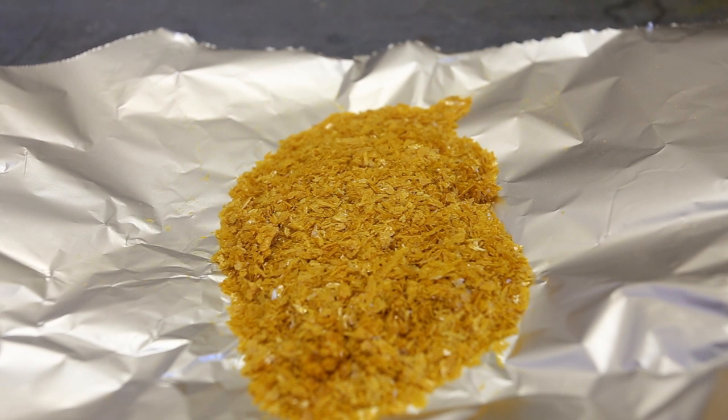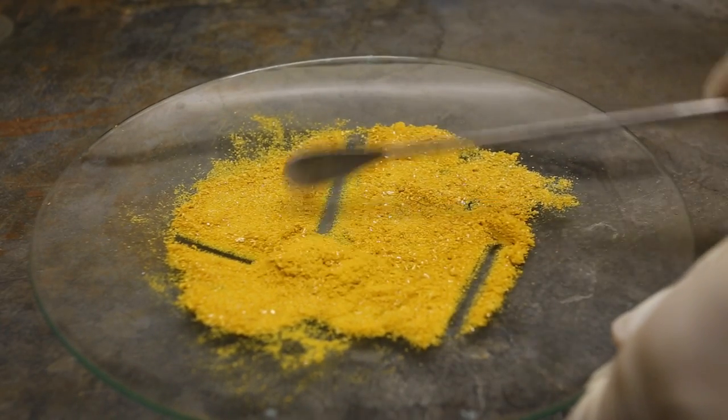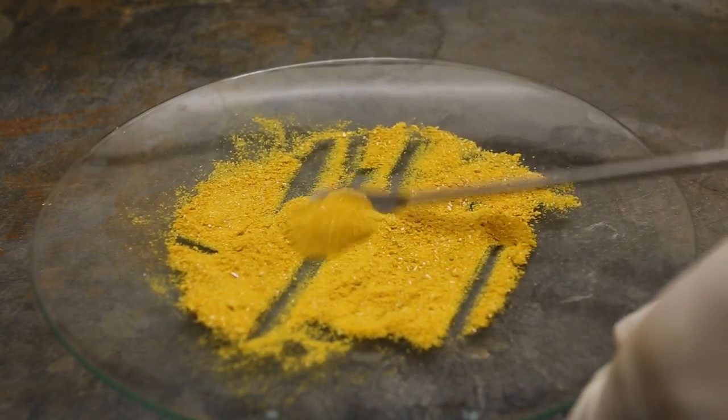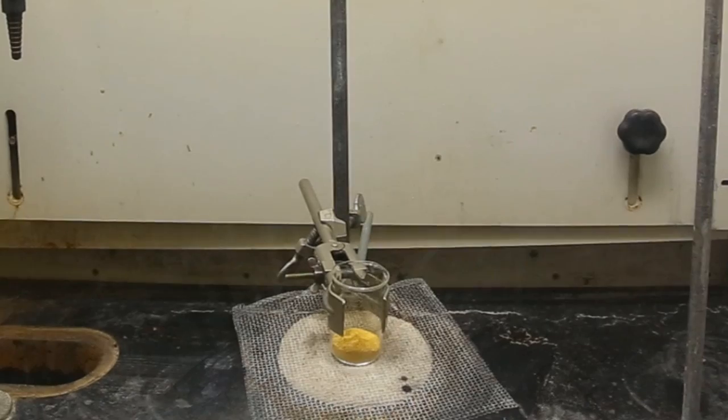I recommend that these crystals be crushed up using a mortar and pestle and then dried in a low temperature oven or left out in a well-ventilated area to dry. This is what the final dry P-Nitroaniline product looked like. The retested melting point was about 137 degrees Celsius, which was much better. And now to test to see if it works.